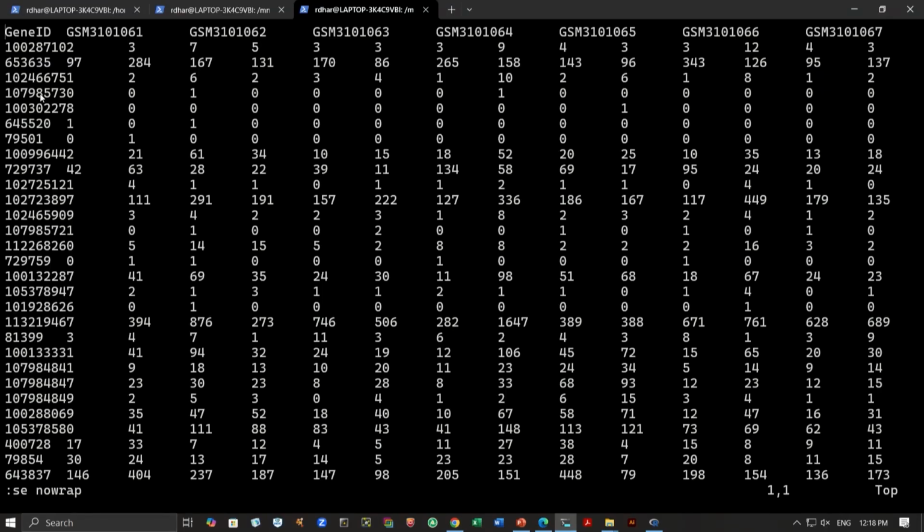There are two things we need, as I mentioned in the presentation. First, we need the metadata, that will connect the sample ID to a specific type, whether it is gastric cancer, diffuse gastric cancer, or intestinal gastric cancer, or normal tissue. So, this is something we will need the metadata for, and we also need the genome annotation, where we need this ID to common gene name mapping. Okay. So, we have both of them.